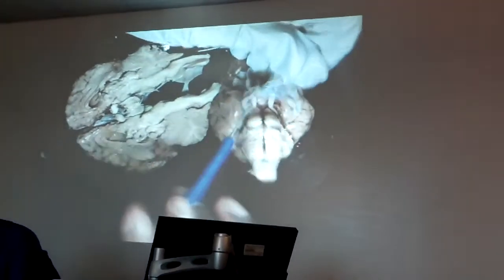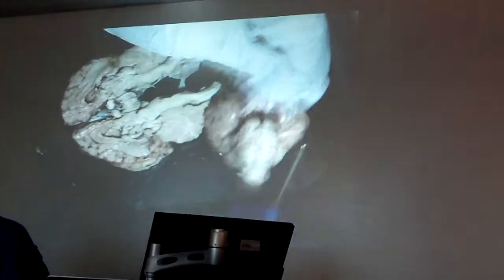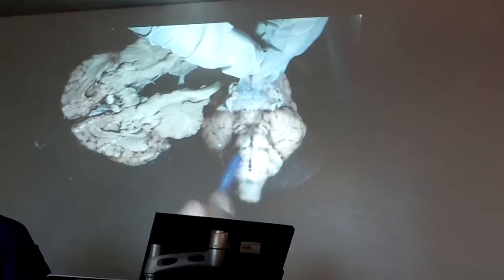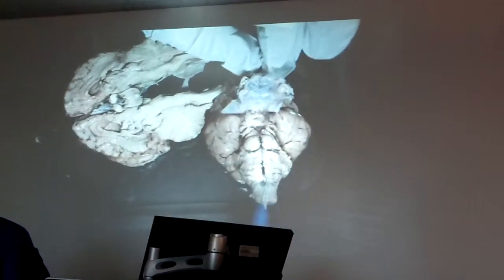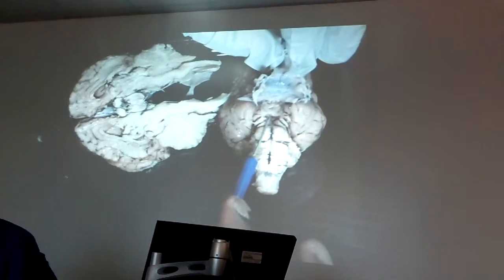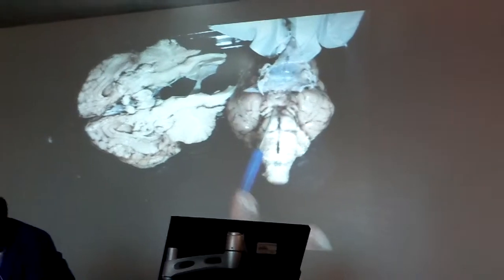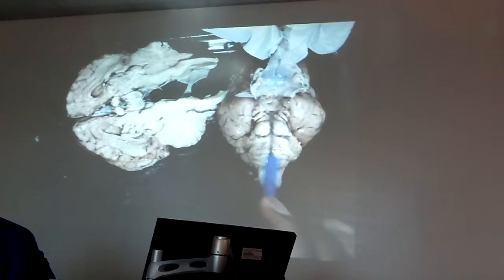Now, this, Mr. Gilmore, has the actual pituitary intact. But when I pull it up, Mr. Gilmore, I can see this structure. Can everybody see? Can you see this right here? Can you see that on the screen? Yeah, they can see it on the screen. That fella is the mammillary body. He's always going to be right below the infundibulum, which is that hole right there. So this is the mammillary body.